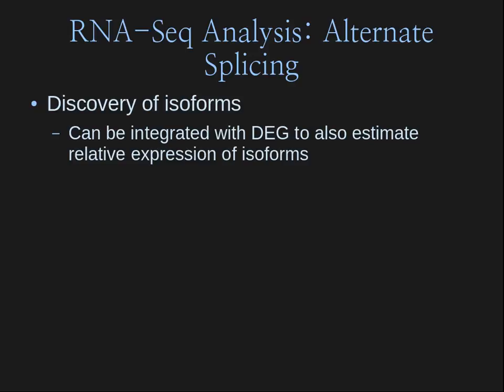And so you can quantify from that. The other thing that is really helpful as well is imagine this one is expressed 10 times more greatly than this one. You can also look at your relative transcripts. If you look at the number, you have a really high amount for A, slightly lower for B, and then not very much for C. And you can get a decent idea for that.